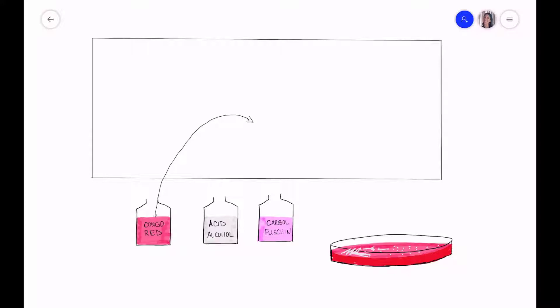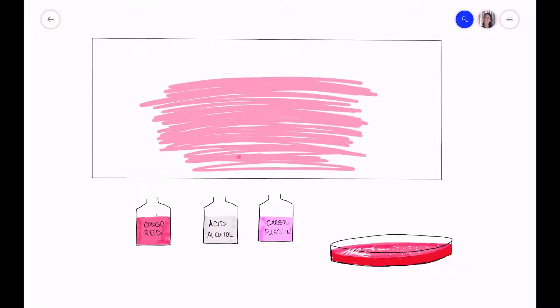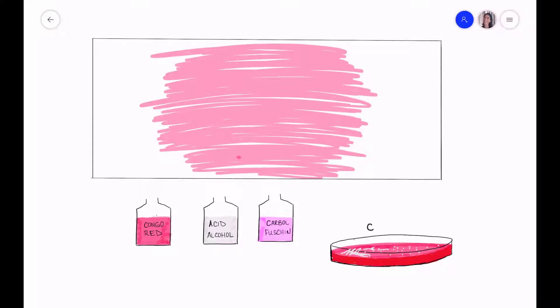So we start with Congo Red and we smear our Congo Red liquid solution all over the slide. This effectively paints the slide kind of a light pink so it paints the background. Then we're going to take some of our culture which includes capsulated bacteria and mix it thoroughly with the Congo Red spreading the bacteria around. Then we allow it to air dry.